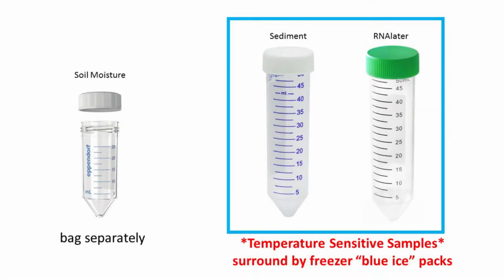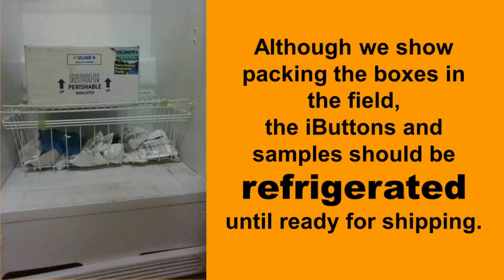Once you have finished packing the cooler, put the lid on top. Fill out the field on the paper metadata sheet for the time and date the box is packed, and then place the paper metadata sheet on top of the lid of the cooler. This will keep it dry. All shipments should be stored in the refrigerator until they are shipped on a Monday, Tuesday, or Wednesday. It is critical that overnight shipping be made on one of these days. Please do not ship later in the week.